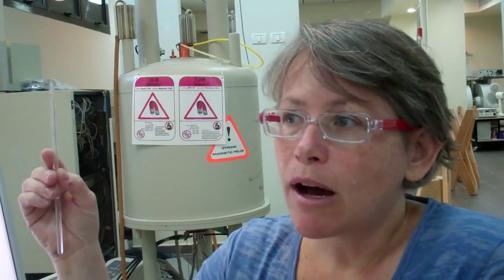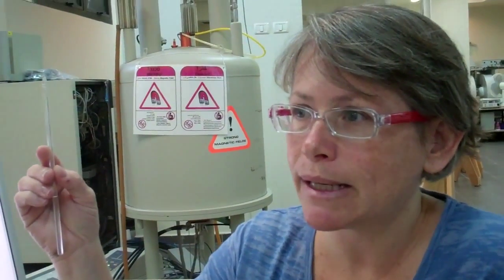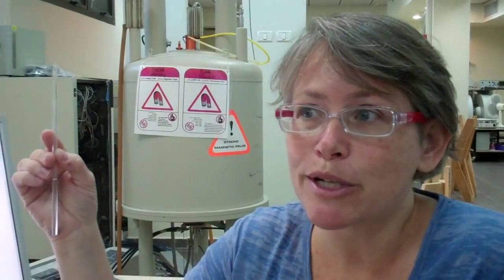Otherwise, it will be hard to compensate for the magnetic field inhomogeneities caused by the jump in magnetic susceptibility at the different liquid-air and liquid-solid interfaces. This will reduce the resolution and sensitivity of your NMR spectrum.